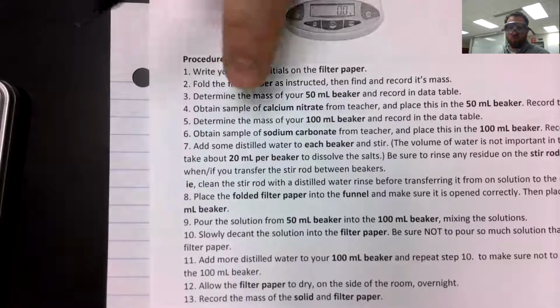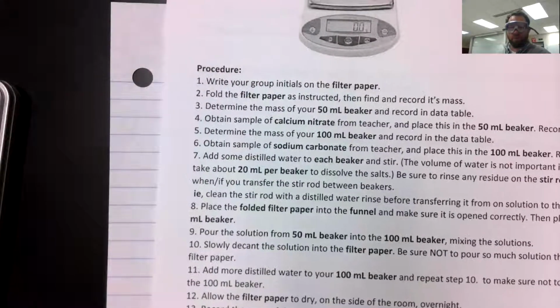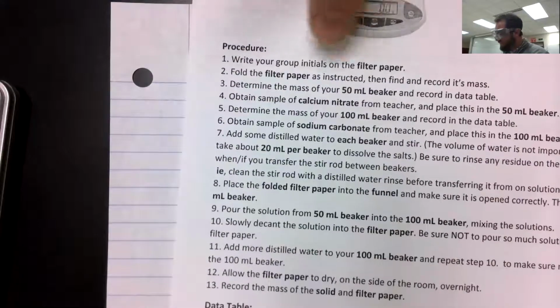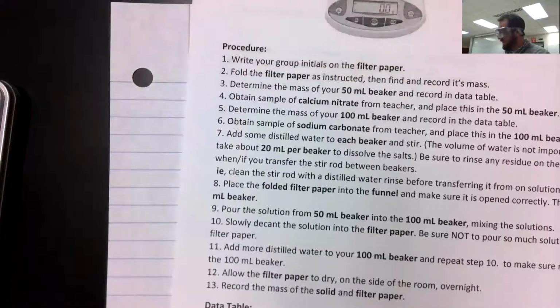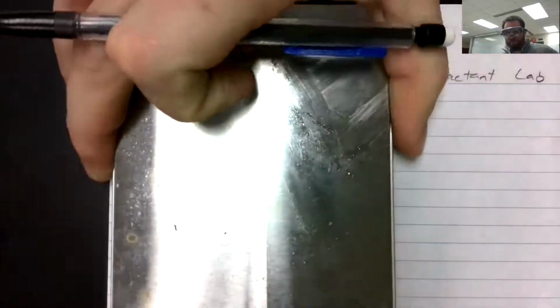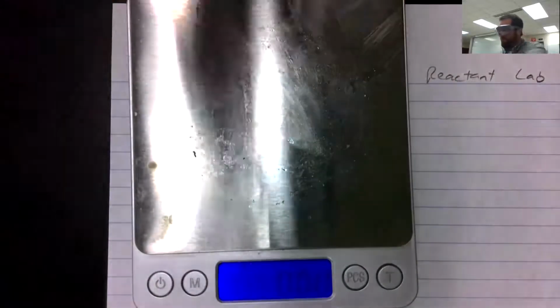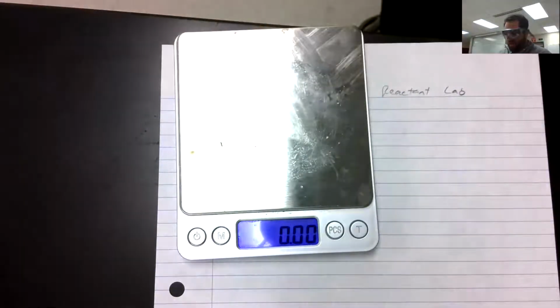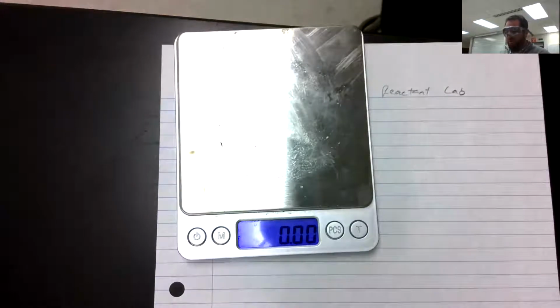All right, cool. Step number 2. Well, we already folded our filter paper, sweet. And now we need to find the mass of our 50 milliliter beakers. We're on step 3. The 50 milliliter beaker is the really small one. So here that is. I'm going to dry this out real quick. Don't want any water in there or on it or anything. All right, so there we go. Let's dry it so I can get it.